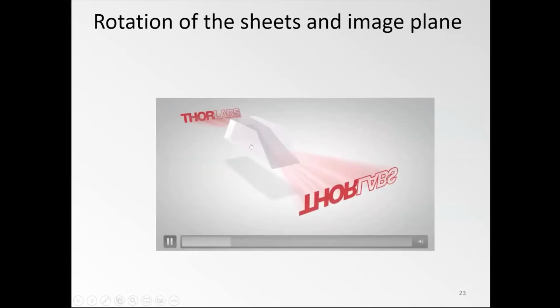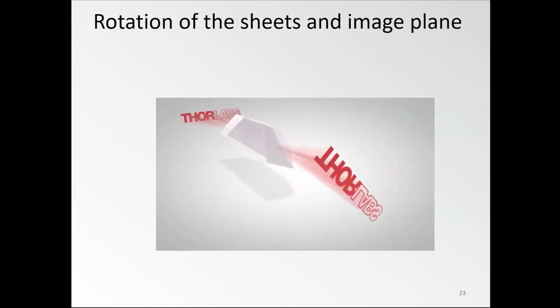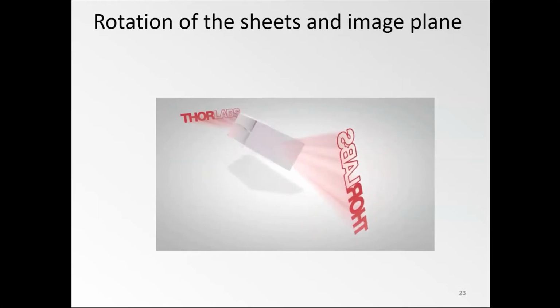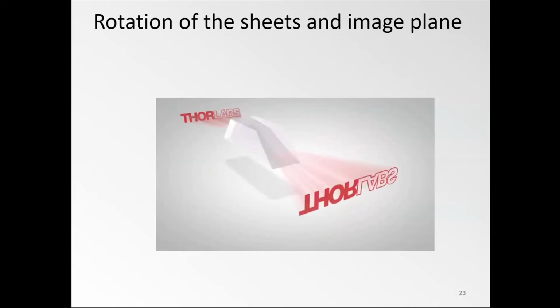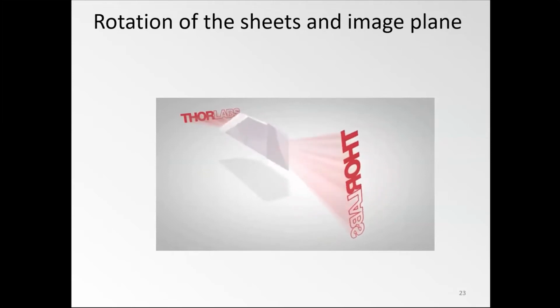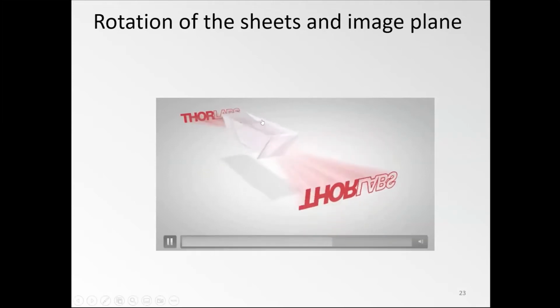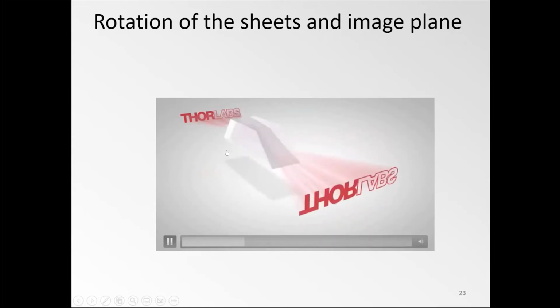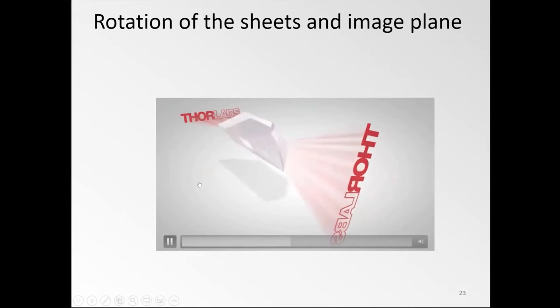You could put it into the microscope and rotate it, and you could rotate both the excitation and, if you want to, also rotate the image so that it always lines up as you would wish. However, this would still be slow, and a bunch of glass in a microscope can also cause dispersion and chromatic aberrations, so it would still not be that desirable.